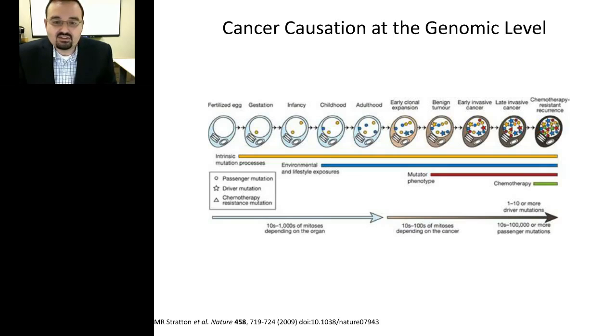After we got through the 2000s, we came upon the advent of next-generation sequencing in 2005, and we saw just a plethora of instruments come out onto the market. Coming now to today, these instruments are producing on the order of billions of bases per day, and in the near future, the advent of nanopore technology and single molecule technology.